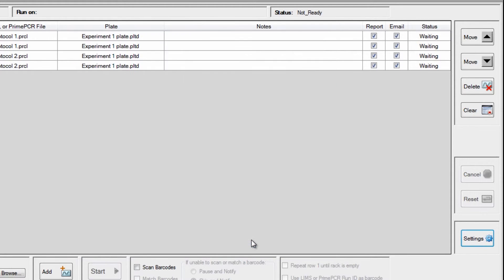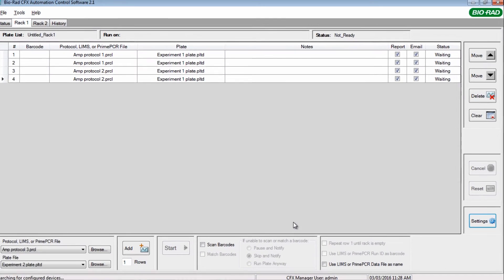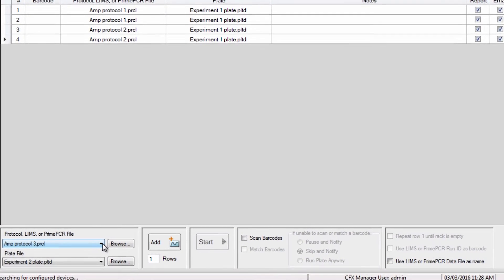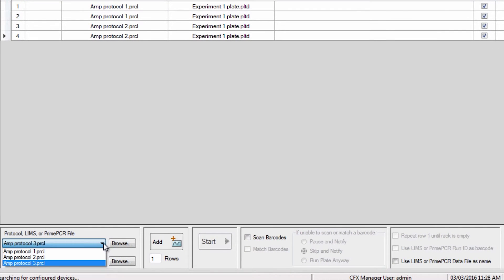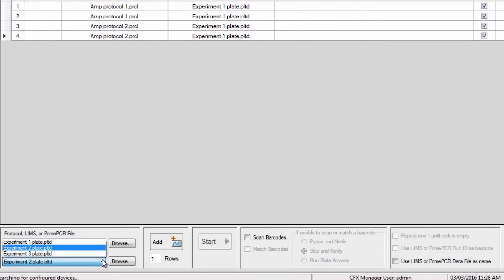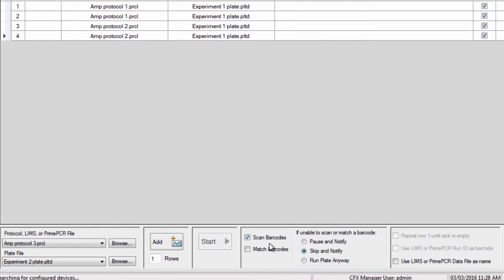Once this is complete, it's simple to set up a plate queue. Select protocol and plate files from the drop-down menus or by using the Browse function. Next, modify the barcode controls. Choose to scan and/or match barcodes and desired actions if unable to scan or match.